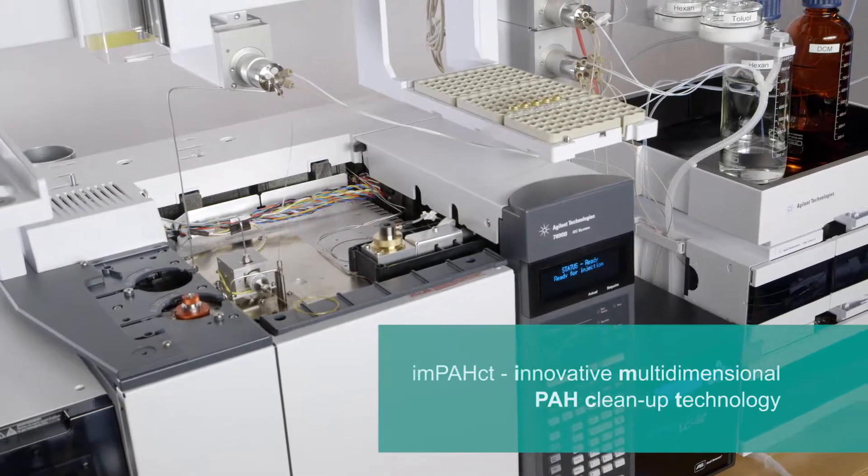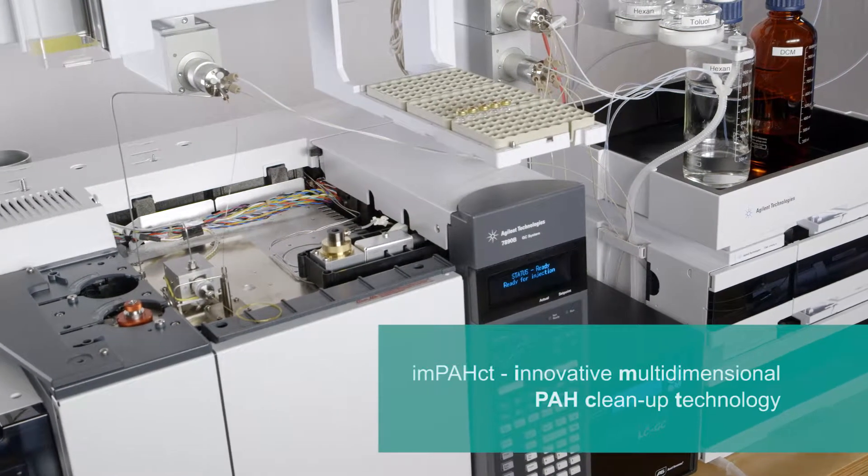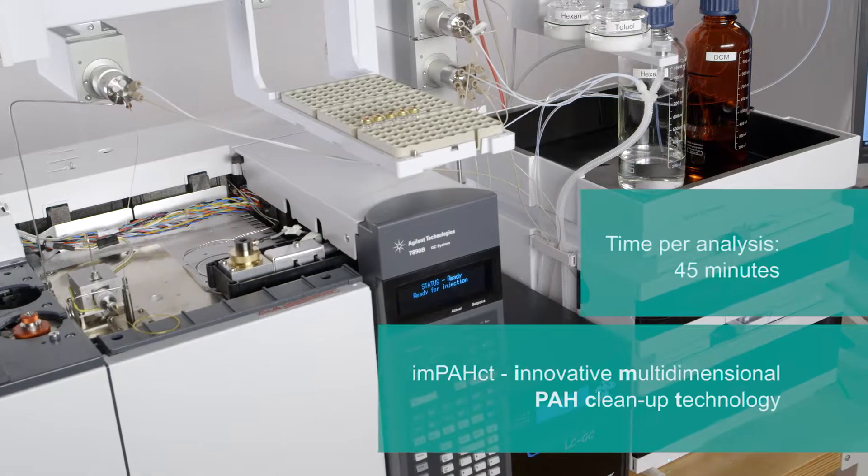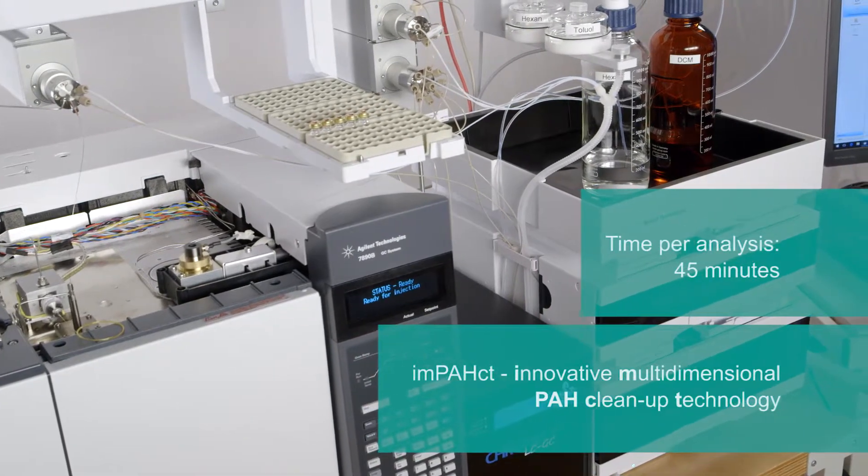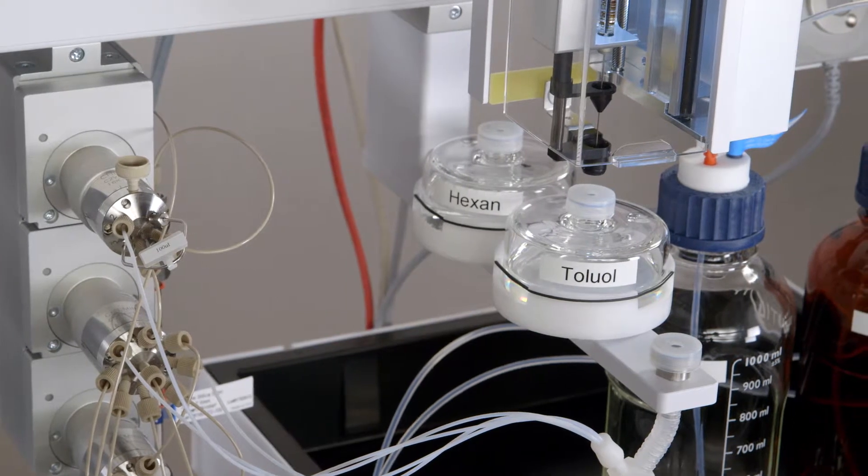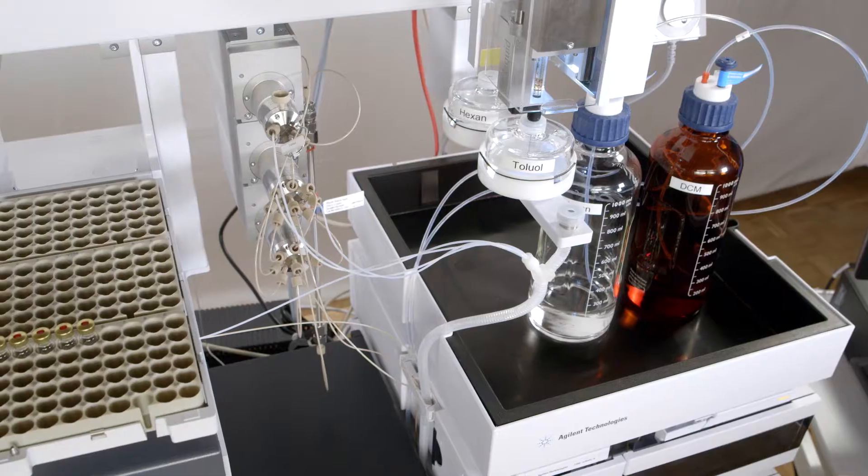Applying the newly developed IMPACT method, innovative multi-dimensional PAH cleanup technology, the system delivers analytical results after 45 minutes only. By using a second HPLC pump, the analysis time can be reduced to 35 minutes.